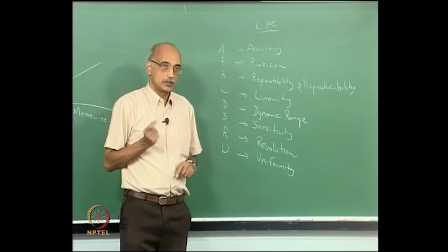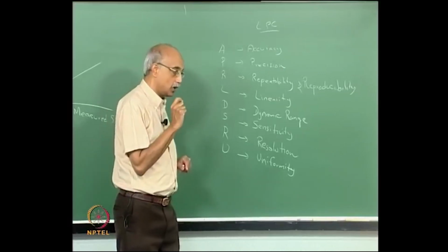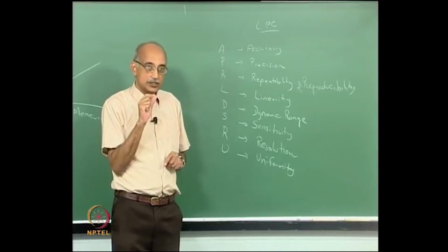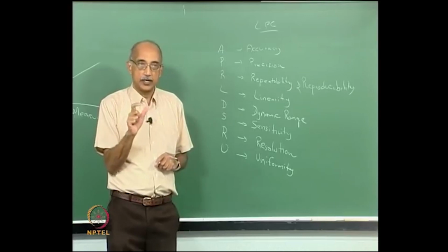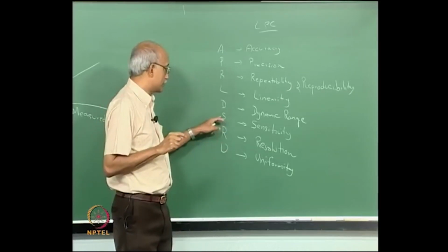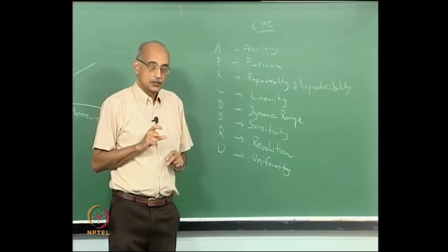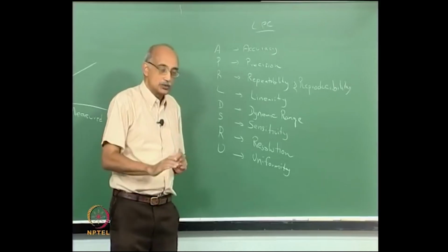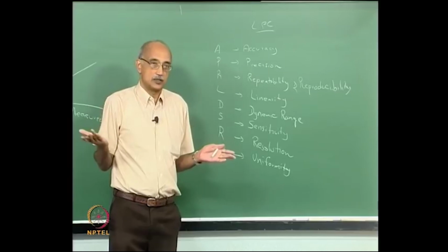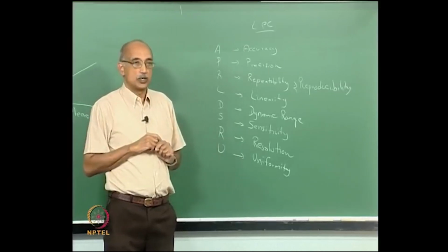Resolution, on the other hand, is slightly different. The resolution is a measure of how closely two particles can be positioned in the sample but still be measured or identified as separate particles. Now that number typically will be larger than the sensitivity parameter, and so an instrument that can measure down to 5 nanometers may not be able to distinguish particles that are, let's say, 10 nanometers apart, in which case there's always a question mark over the data.